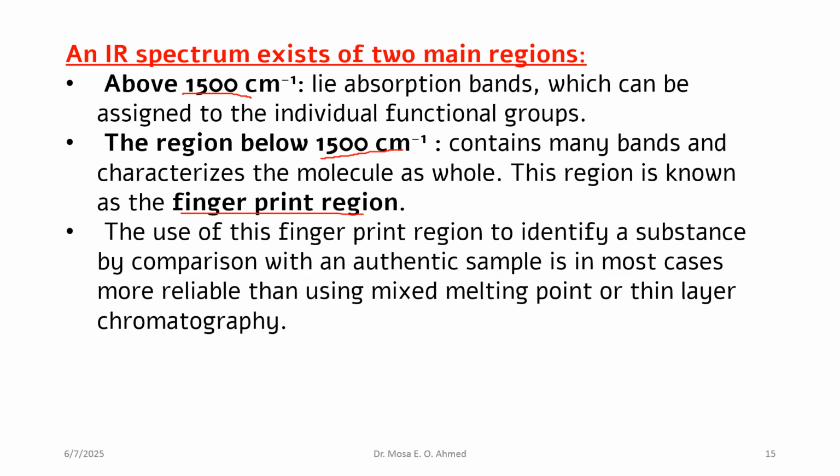The fingerprint region can be used to identify a substance by comparing the sample with an authentic sample, and in most cases it is more useful than using melting point or thin layer chromatography.